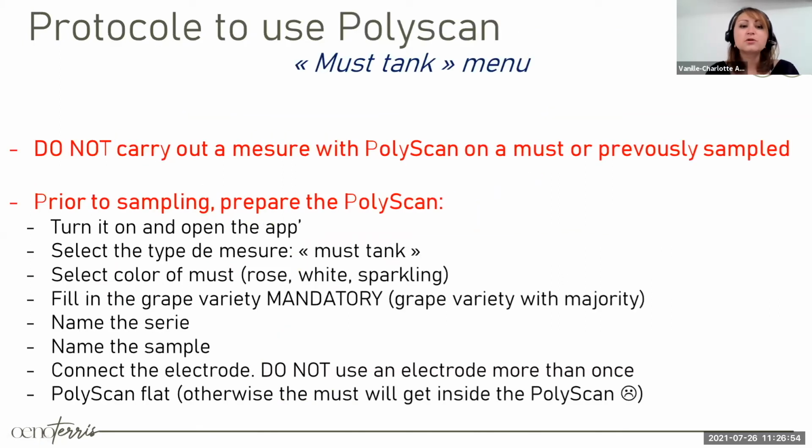So just a small reminder on the protocol to use the PolyScan on the must tank menu. First, do not carry out a measure with PolyScan on a must or wine that has been previously sampled.